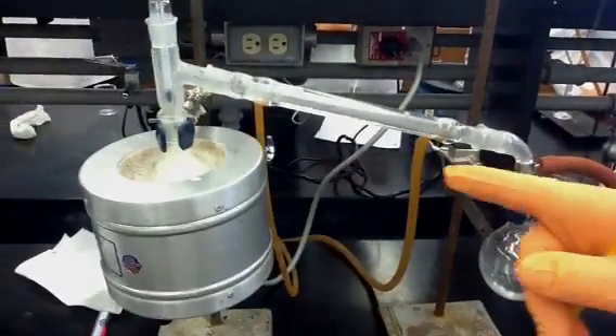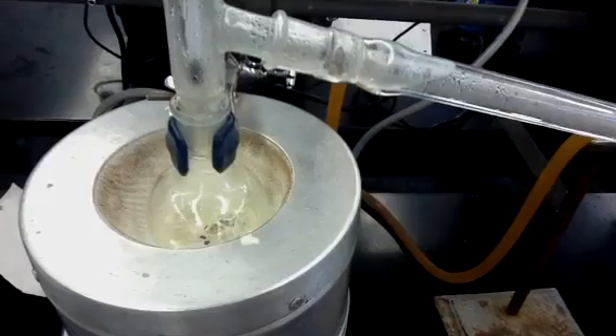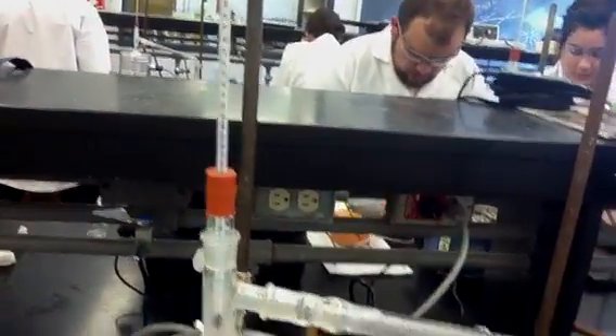As you can see, we got the benzaldehyde to boiling, and we recorded the temperature of our first drop of distillate at 84 degrees Celsius. You can see here in the receiver flask.